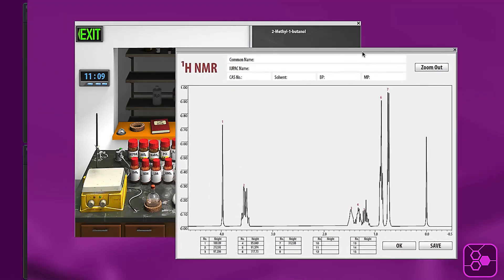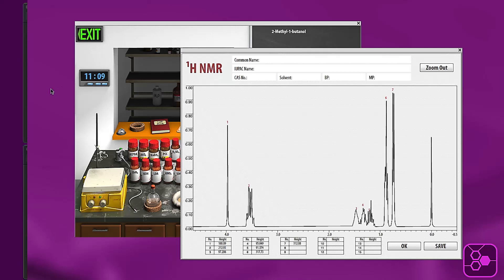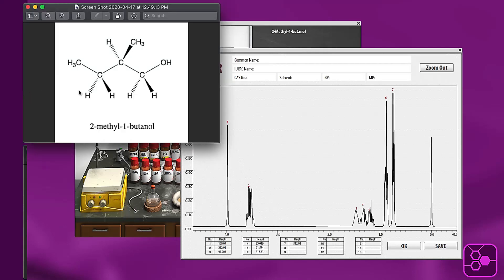Now I have a picture here of what you might want to draw when you get your product and you're trying to decipher this proton NMR. So this is 2-methyl-1-butanol. I just have explicitly put out all the hydrogens so that you can see them clearly.